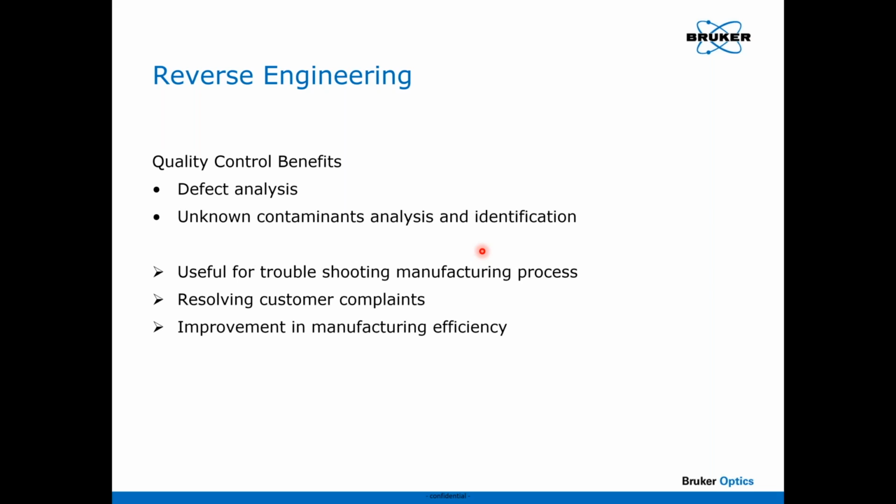Say you make a food product or some other pharmaceutical product, and a customer complains they broke a tooth on something hard in a food product. How do you analyze that? So you need to maintain a really good recording process, and we'll talk about that, and also work in a validated environment if at all possible when you do any of these analyses.